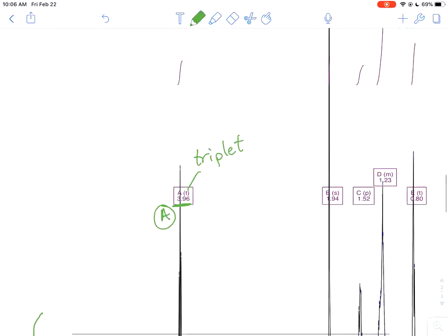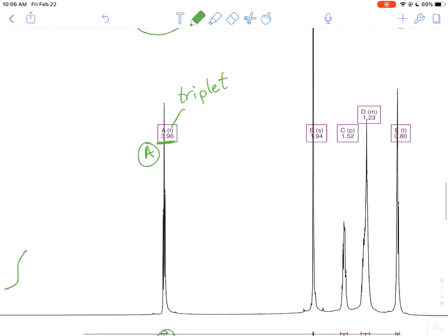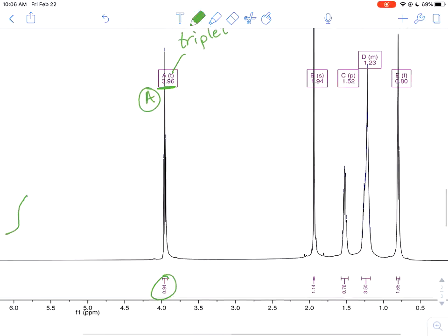Now in the previous video we talked about how the spectrum of banana oil had integration lines. They were little curves. And actually you do see these curves up above. It's these guys, the relative heights, but they don't show up for all of them. And then rather than just measuring them, the computer actually, or rather the software goes through and calculates the area under the curve. But that requires the person who actually did the workup, who actually told the computer what to do, did proper integration.